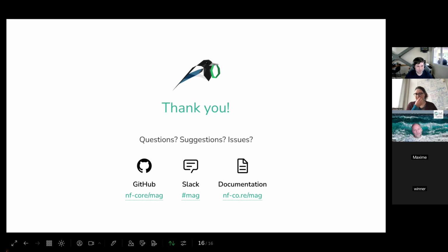And just one comment, the Flongles have been discontinued, so you will not be able to run Flongles anymore for ONT. Yeah, I heard something about that. That's terrible. It's super good to have sometimes. Could have come in very handy for some things, but yeah, unfortunately.